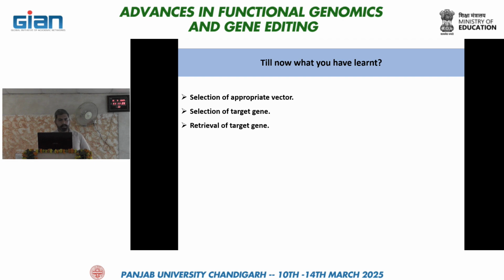With this, you have done these three things. First of all, you now know how to select an appropriate vector, and from where you can source it, and you can choose on the criteria which I have told earlier. And after that, selection of target gene, that depends on your work, what gene you are going to target, and the factors affecting the selection of target. I have mentioned that the gene sequence should be known, and it should have a PAM region as well, which we'll discuss in the later section.